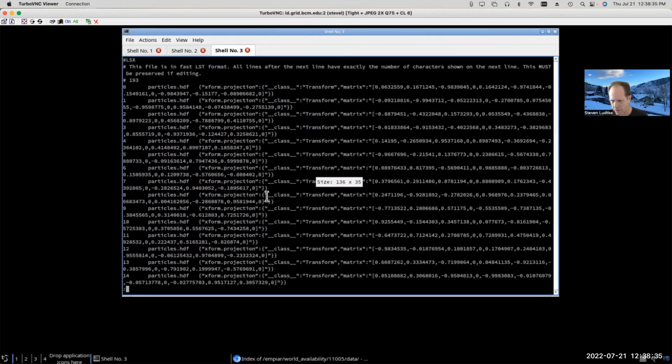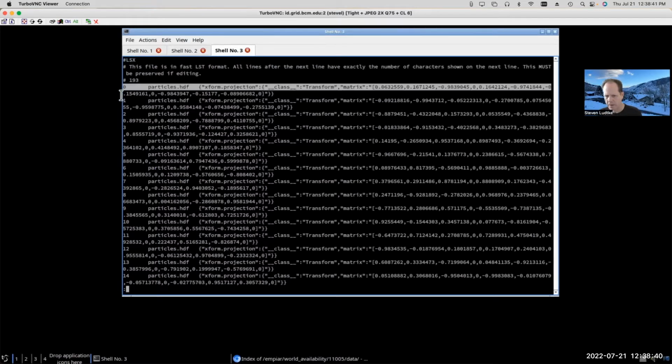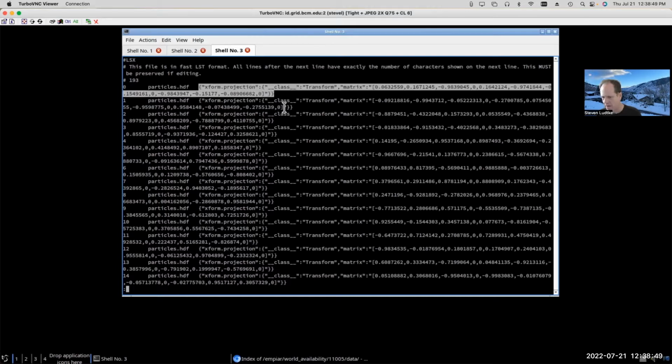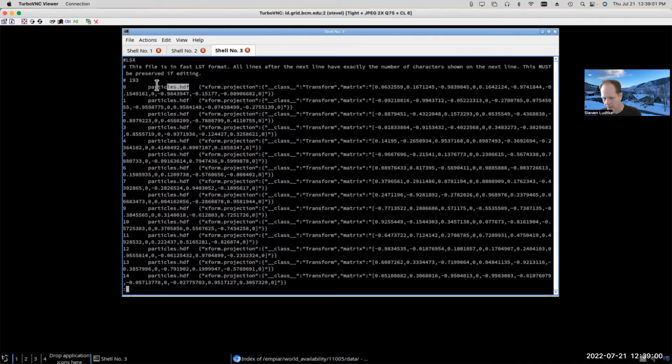And the idea is that, sort of like the star file, you will have one particle per line in this file. The difference is that the metadata that you can provide after that is then in basically a JSON-like format. So basically, you have the particle number and then the file name. And that's how LST files have always been formatted. Basically, an LST file was just sort of a way of virtually grouping together a bunch of particles that were in multiple files into a single file without having to copy them.